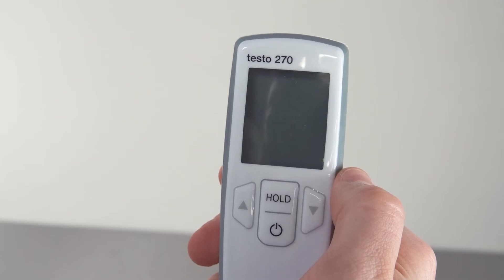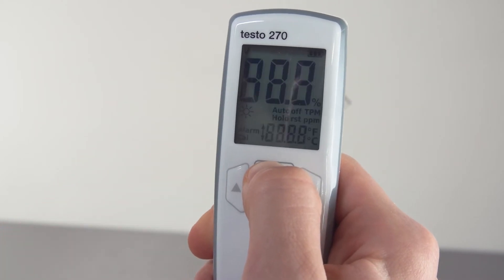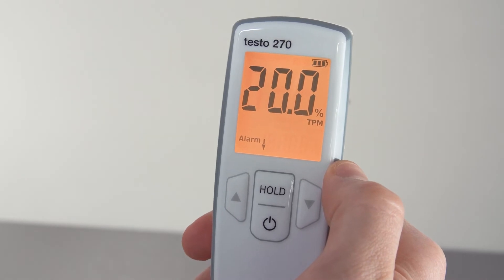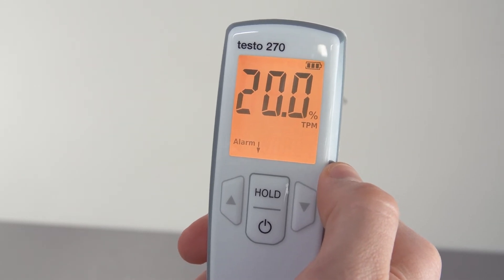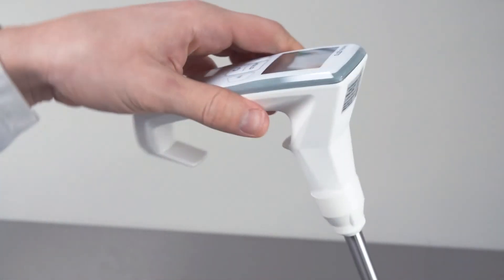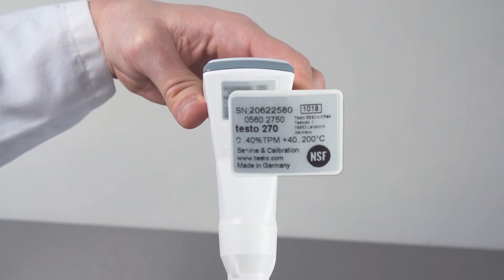If it does become necessary to alter the instrument settings, proceed as follows: hold down the hold key while the instrument is switched off and briefly press the on key at the same time. Your testo 270 may be protected by a PIN — this is the last two digits of the serial number, found on the rear of the measuring instrument.